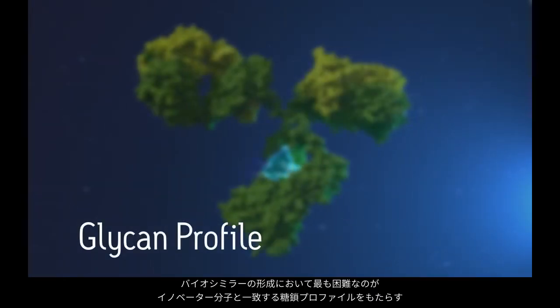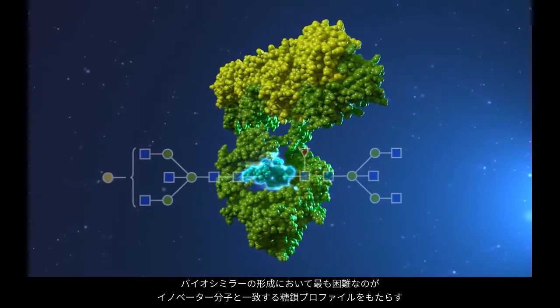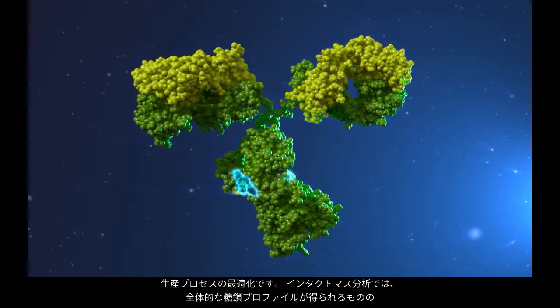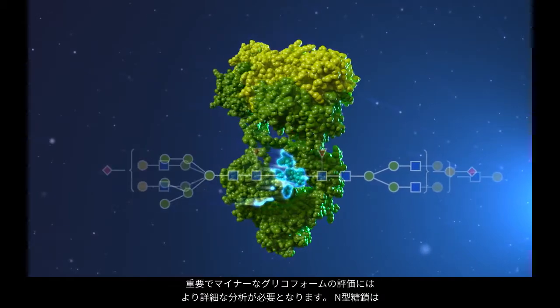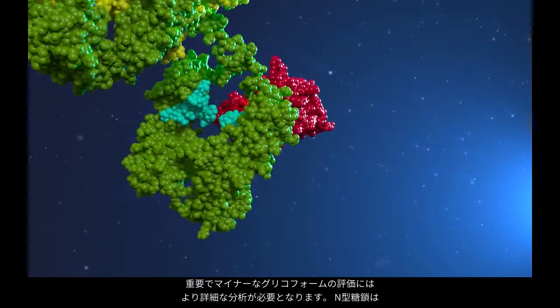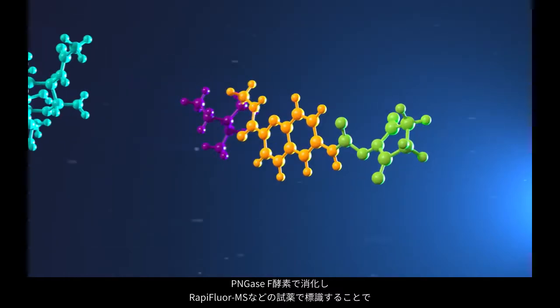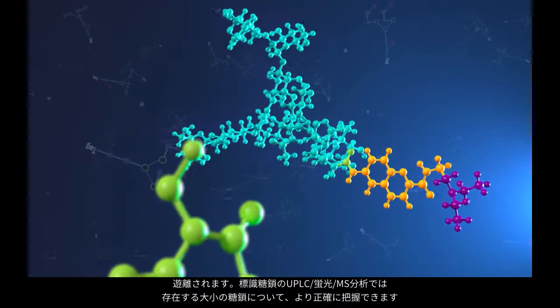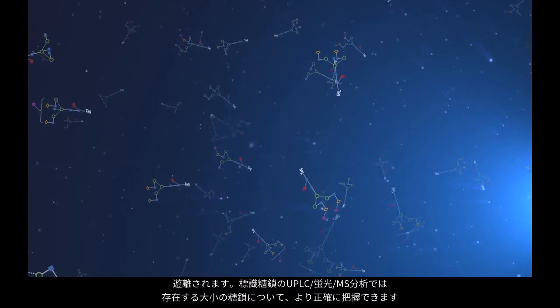One of the most challenging aspects of creating a biosimilar is optimizing a production process that yields a glycan profile consistent with that of an innovator molecule. While intact mass analysis can provide an overall glycoprofile, assessment of critical minor glycoforms requires more detailed analysis. N-glycans can be released by digestion with the enzyme PNGase F and labeled with a reagent such as RapiFluor-MS. UPLC fluorescence MS of the labeled glycans gives a more accurate picture of the major and minor glycans present.